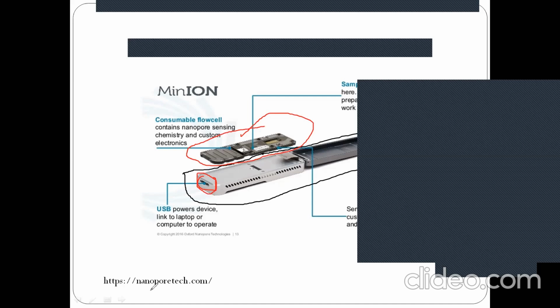And if you find that okay, to conclude your entire research, maybe 10 or 12 continuous sequencing will give you your conclusive result. So maybe this 1.5 lakh or 2 lakh rupees spending is definitely worthy for you. But maybe if you are really interested in metagenomics, you are continuously sequencing maybe 500 samples, 100 samples, 500 samples, 600 samples.